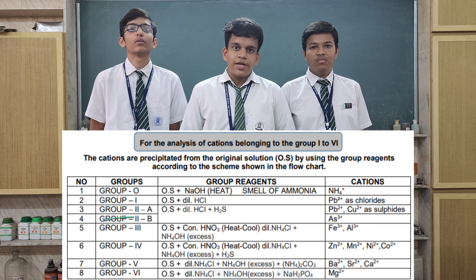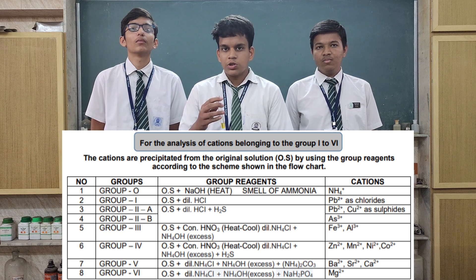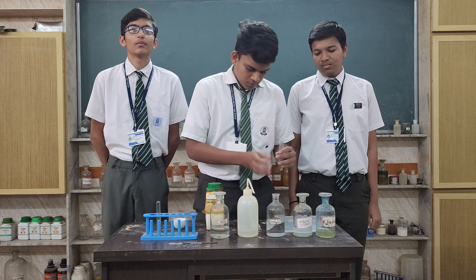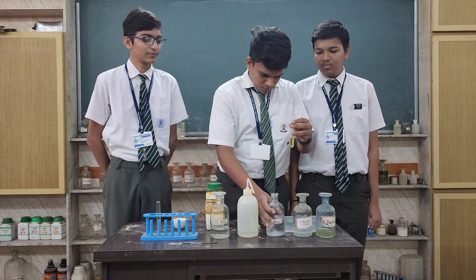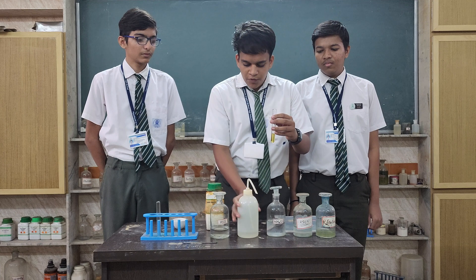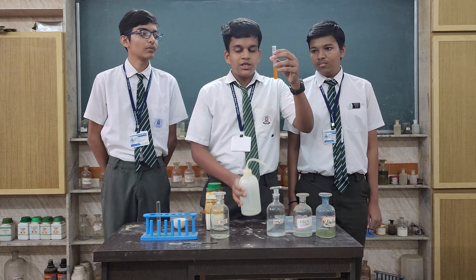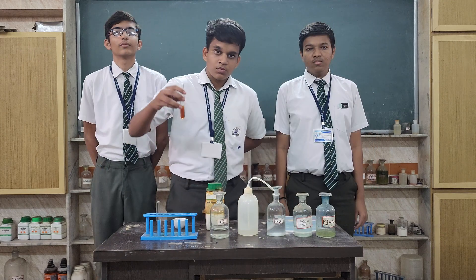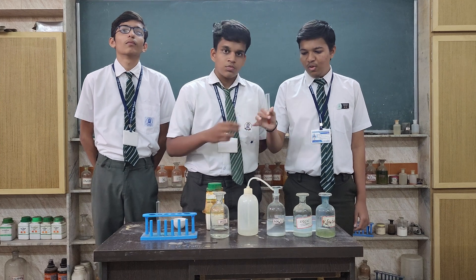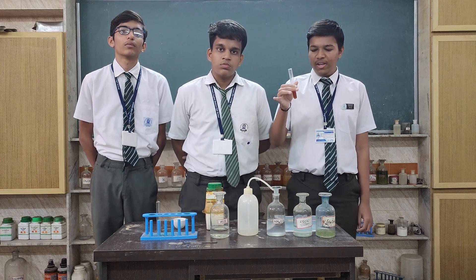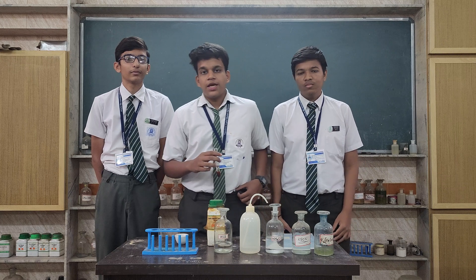For the confirmatory test of Group 3 cations, NH₄Cl (NFO-CL) is added to the original solution, which gives a yellow-brown precipitate. The addition of NH₄Cl and NH₄OH gives a brown precipitate, which indicates that Group 3 is present.